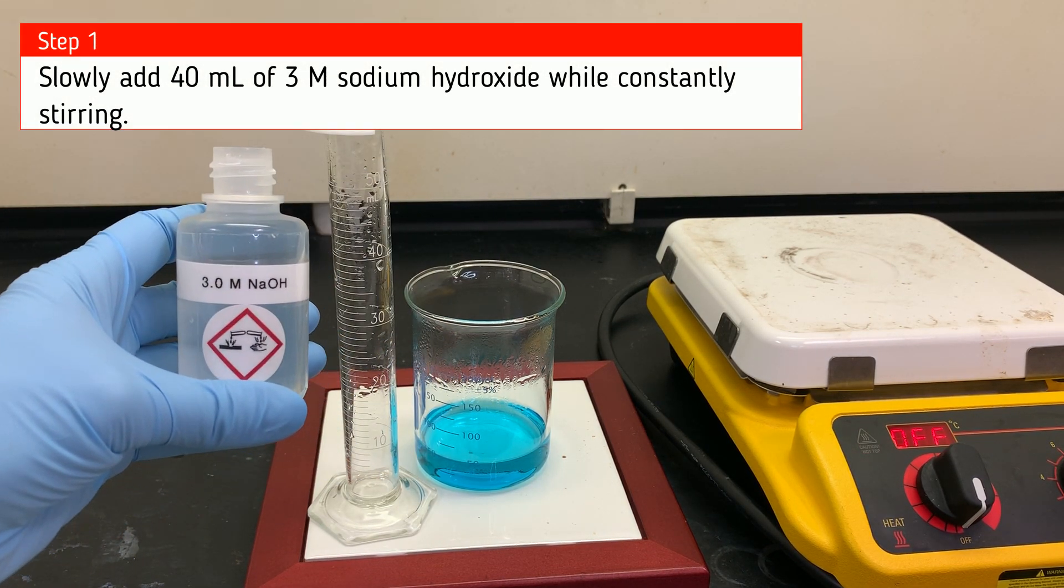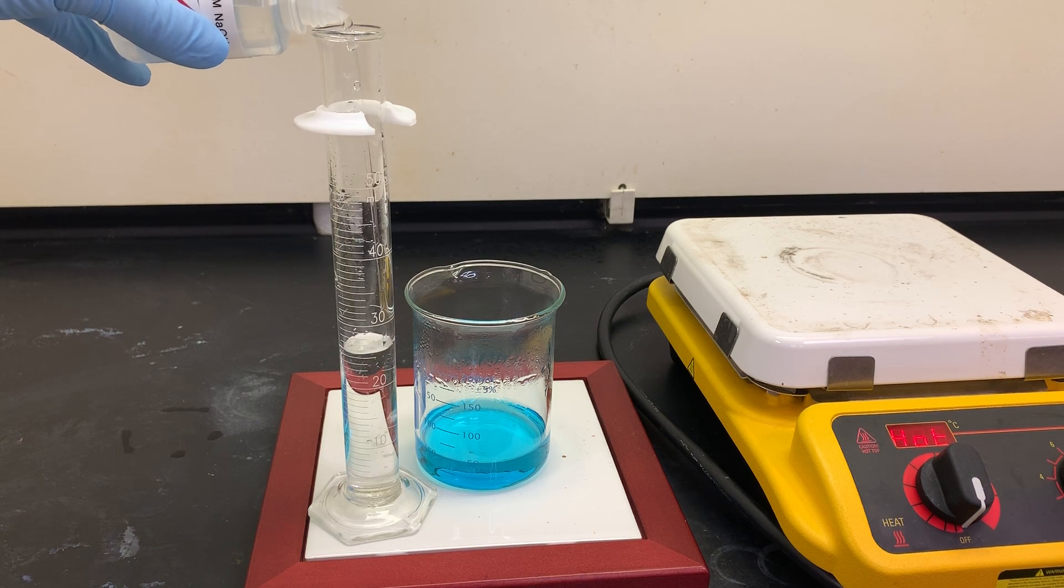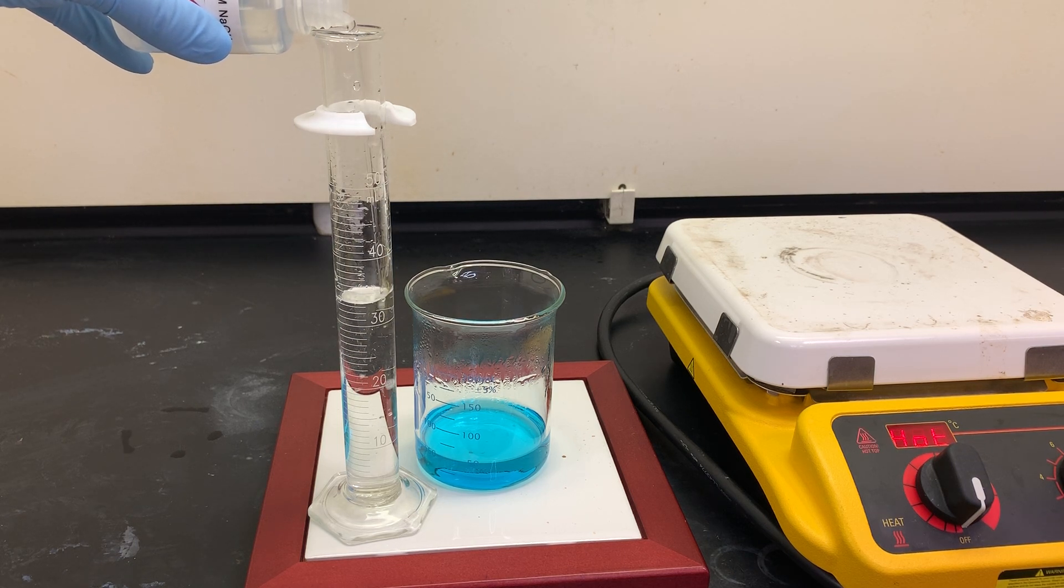We'll start off by taking 40 milliliters of a three molar sodium hydroxide solution and add it to our mixture. We're going to be doing this while we stir constantly to get everything as reacted as possible.